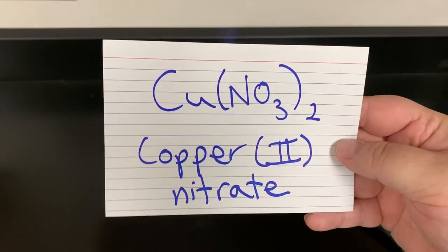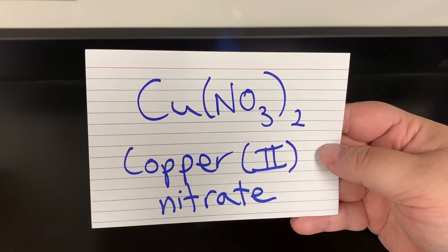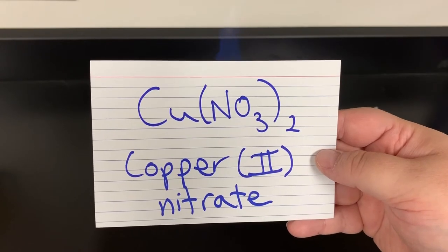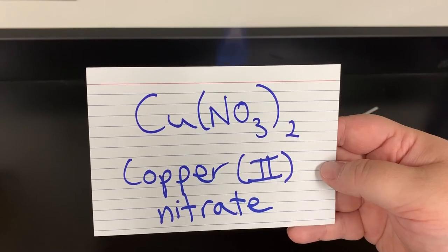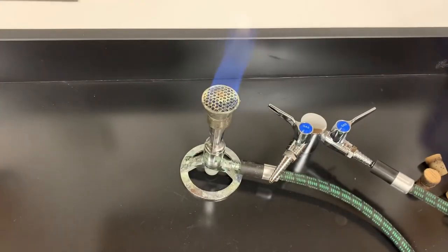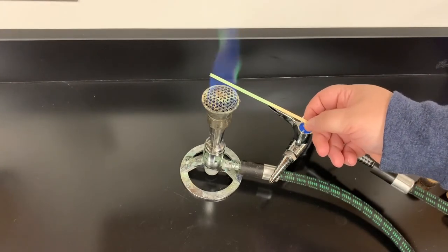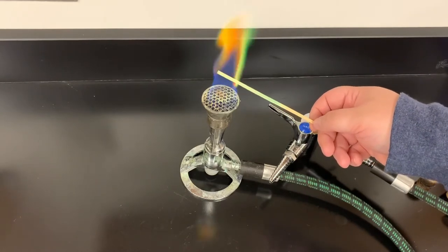Next one is copper(II) nitrate — Cu(NO₃)₂ is the chemical formula, copper(II) nitrate. This one also turns the flame green.